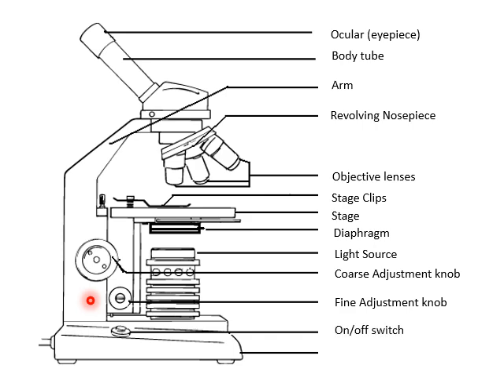Obviously, we have an on and off switch. Sometimes with some of the microscopes that they have, actually we have them at West Ferris, the on and off switch also is like a dimmer switch. So rather than having the light adjustment up here with the diaphragm here, we can adjust the amount of light from down. There's a little dial that's down here. I find it a tad bit annoying, but you know, once you get used to your microscope, you get used to your microscope. And here at the bottom, we have the base, which basically supports the whole microscope.